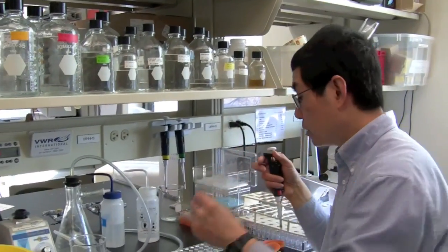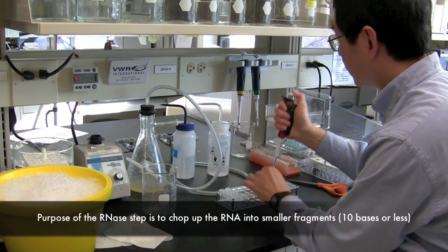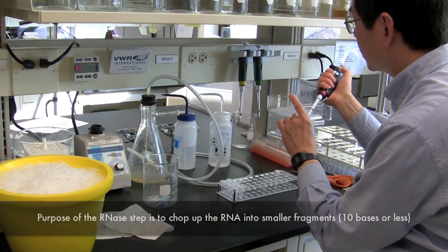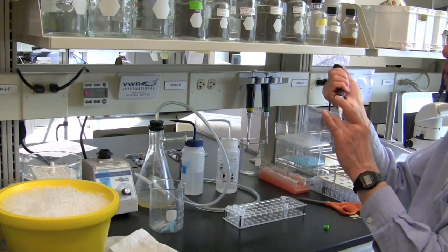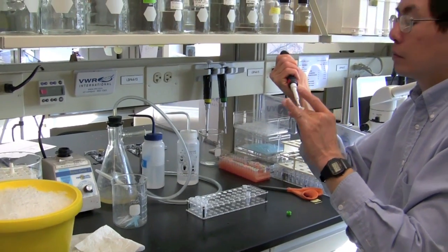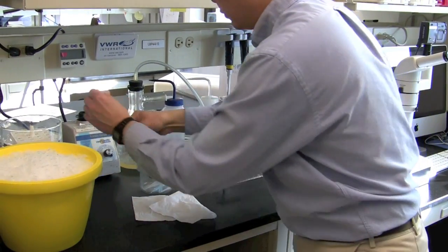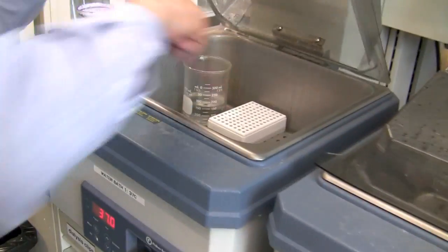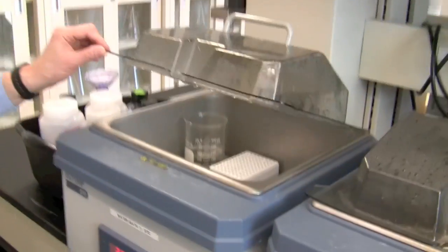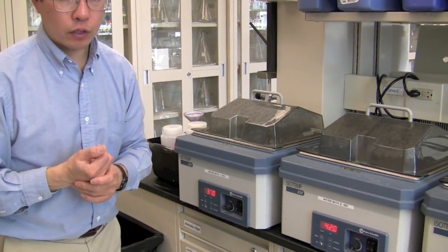I'm flicking it to mix it. I could vortex it. Actually, I'm going to go ahead and vortex it briefly before putting it into the water bath at 37 degrees. I'm going to let it sit here for 15 minutes, and then we'll do the next step, which is to extract with phenol.